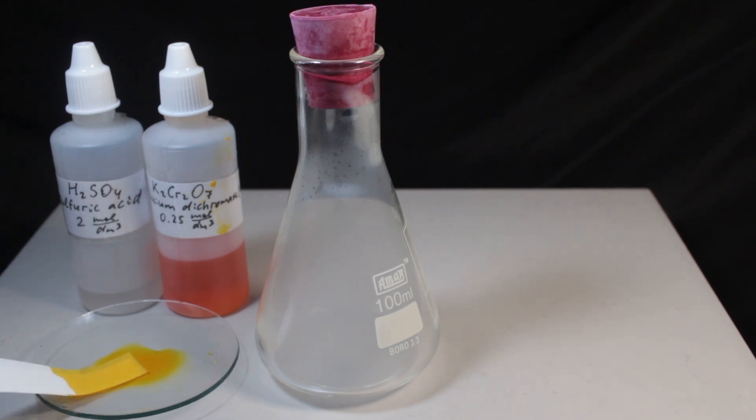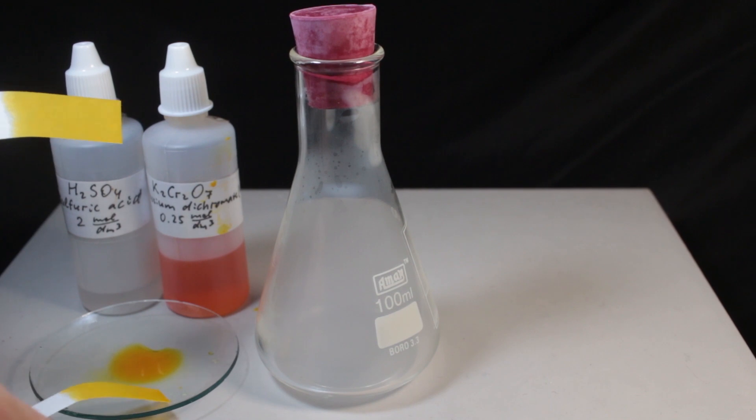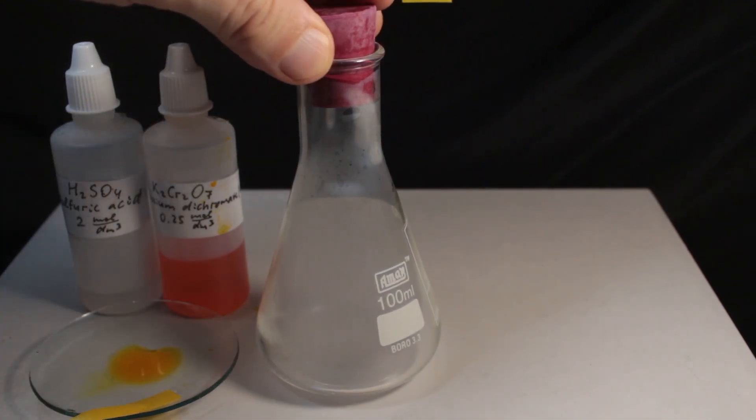Here is filter paper. I dip it in acidified potassium dichromate. One I keep as control and another I put in the gas.